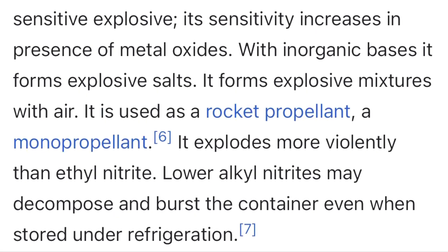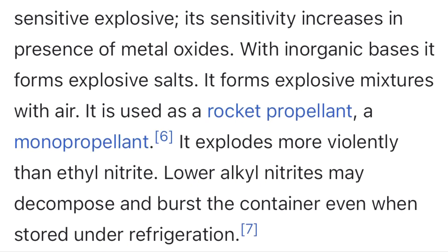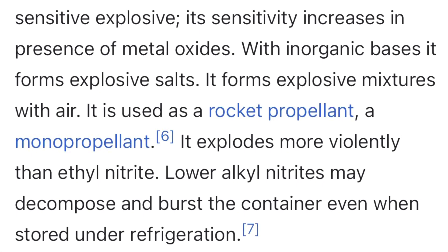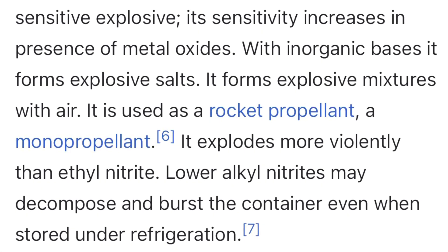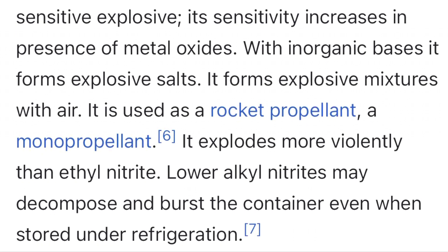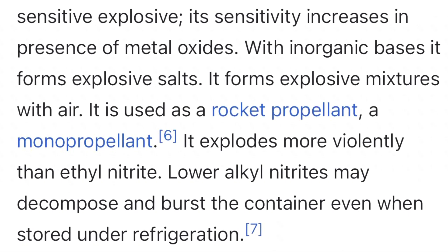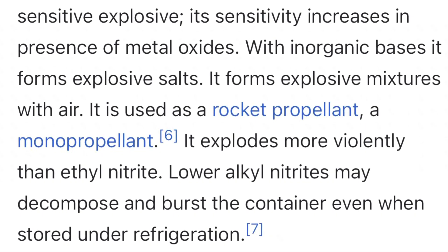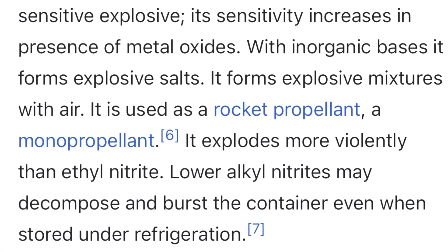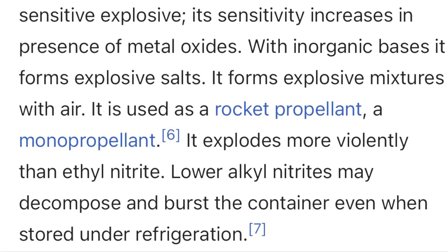Methyl nitrite is a lot more cursed than I thought, apparently — it can detonate. I think I gotta stop messing around with that stuff, however cool it is. It's like flammable white gas, but I can't risk a detonation — that's just horrible. At least it's not methyl nitrate, I guess. I doubt this stuff detonates easily, but I don't want to risk it. It gets even more sensitive in the presence of metal oxides and inorganic bases — it forms explosive salts. So I think I'm going to stop messing around with this stuff, because it's pretty cursed, unfortunately.